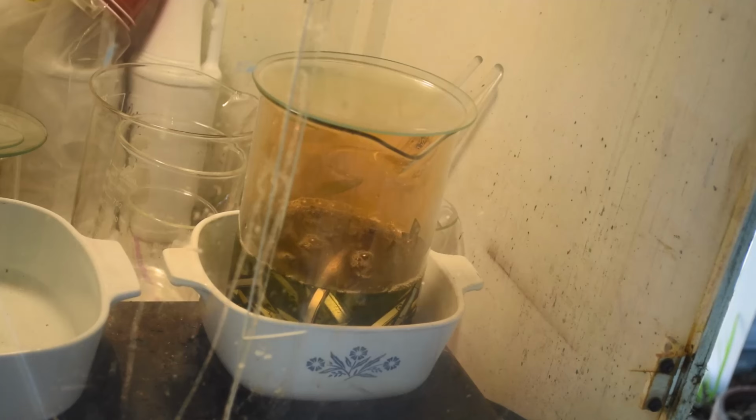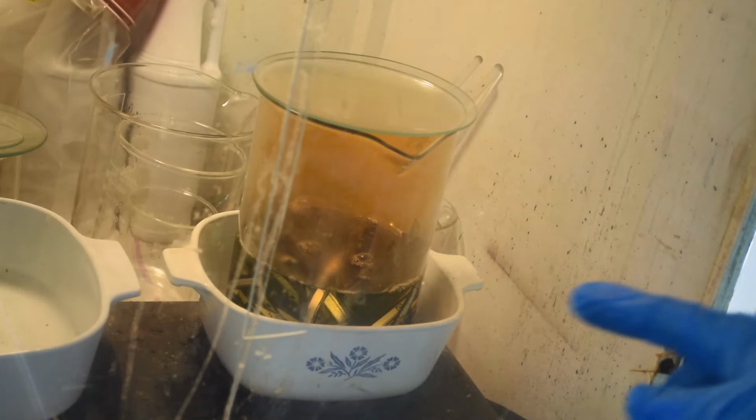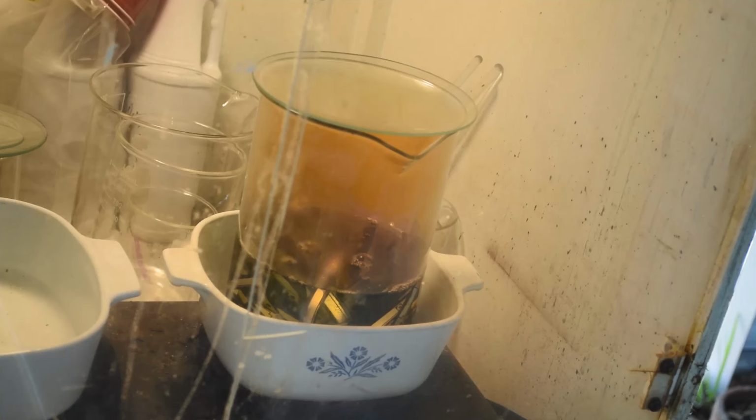So we'll let this cook for a while and see what happens. See if it gets rid of all that metal in there. If not, I may put a little more nitric acid. Yeah, we got a heck of a good reaction going on so far. That's a pretty potent nitric acid I made. It's better than the azeotrope. So we'll just let that cook back up. Put a little heat to it. That should speed things up.